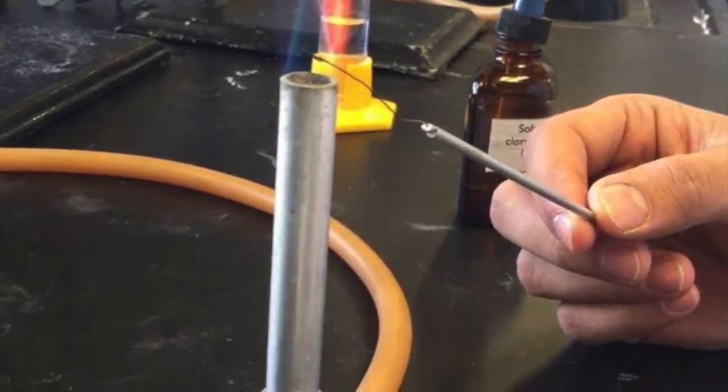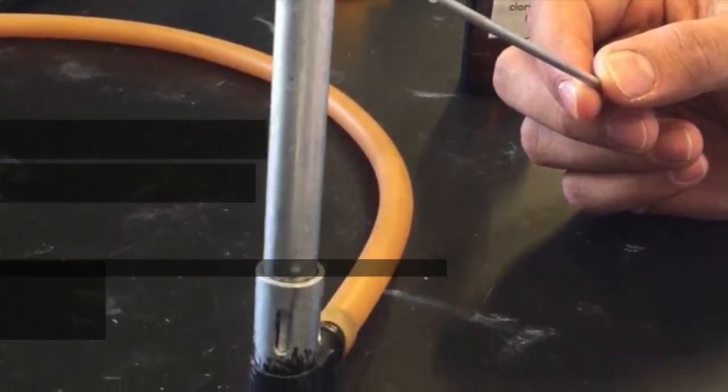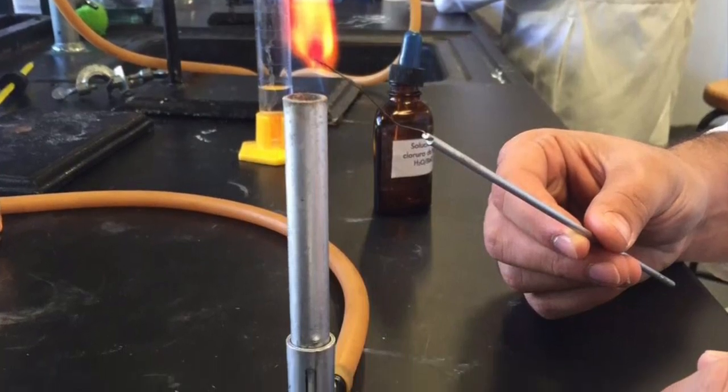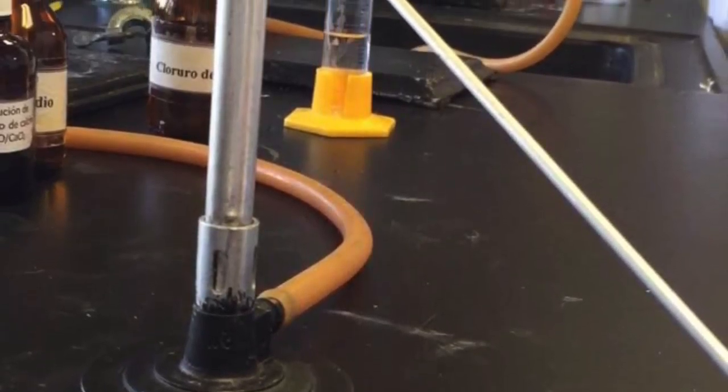On this practice, we tried to learn the processes of distillation and sublimation. We also learned how to use the Bunsen burner. The main objective of this practice was to identify the cations by observing the color of the flame.